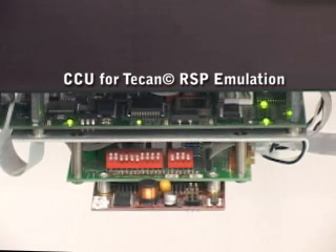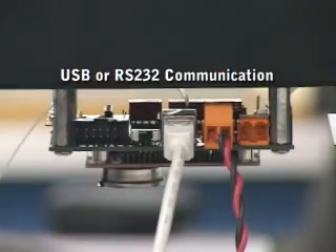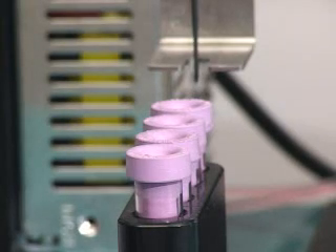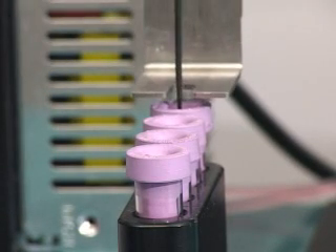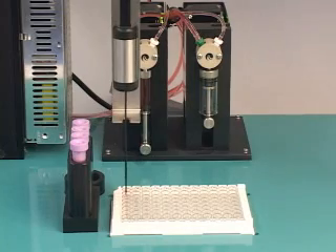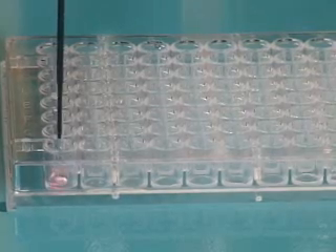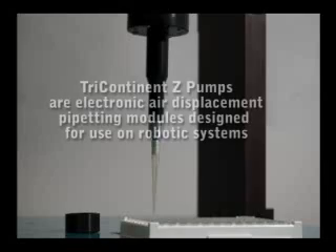Some optional features include Electronics CCU for Tecan RSP emulation, USB or RS-232 communication, fully adjustable liquid level detection, tube stripper mechanism for cap piercing applications, and Z axis mounted pipette.